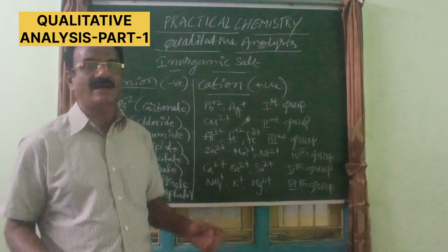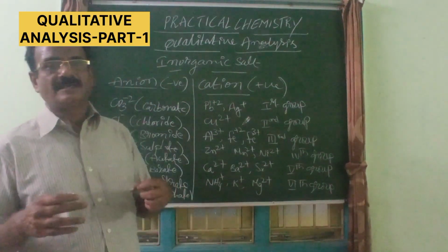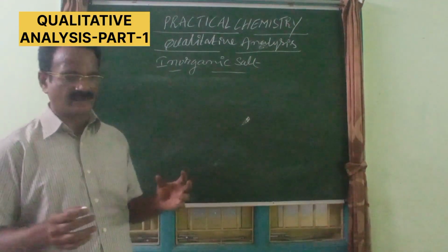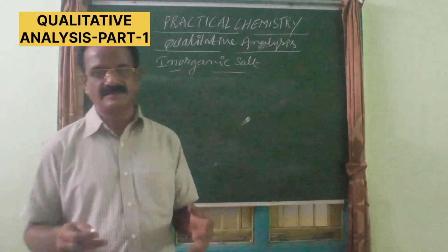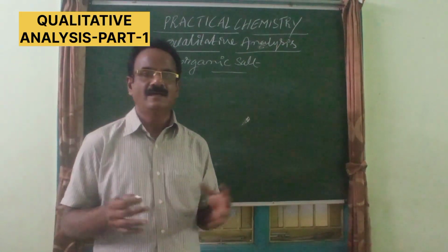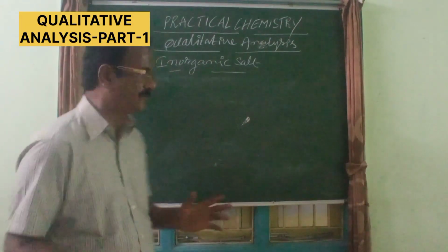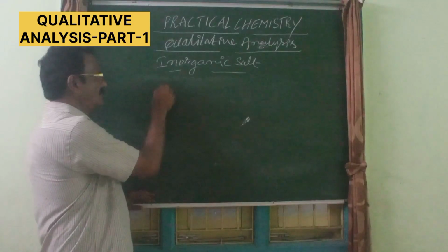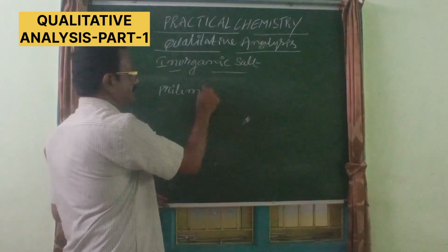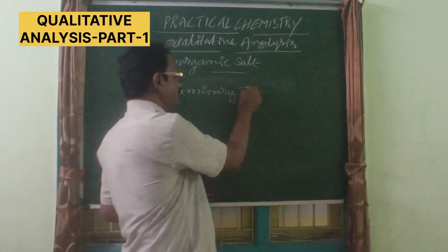Let us see how you have to identify the ions present in the inorganic salt. The procedure can be divided, for the convenience of the analyst, into the following parts. The procedure incorporates preliminary tests.